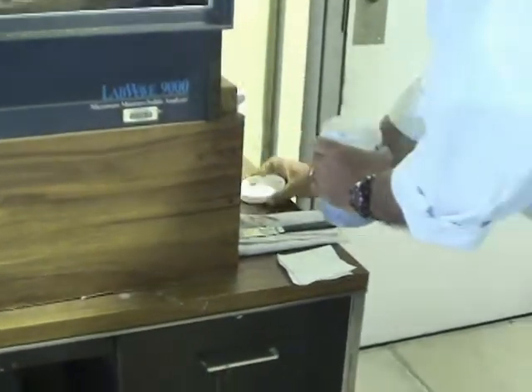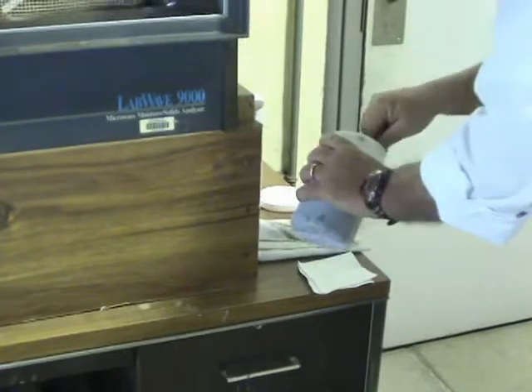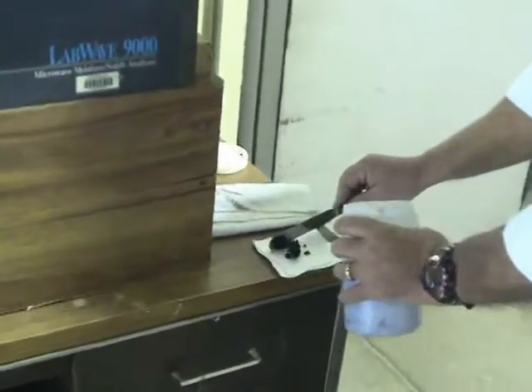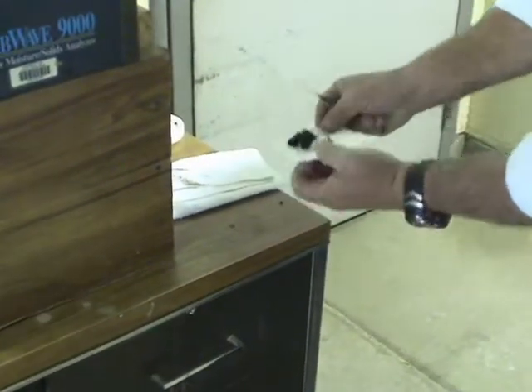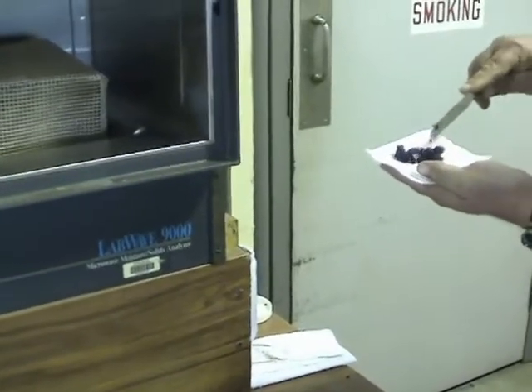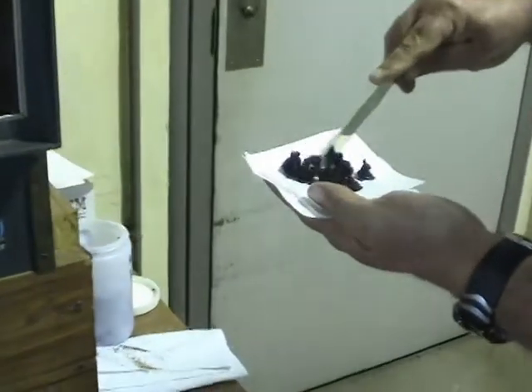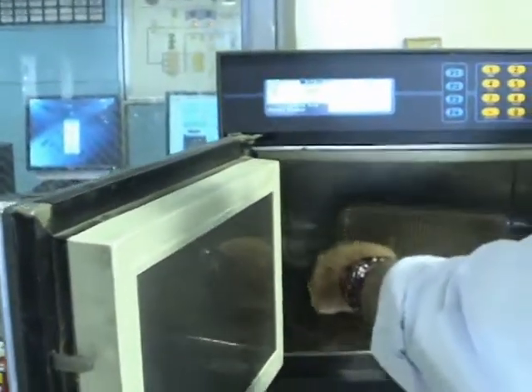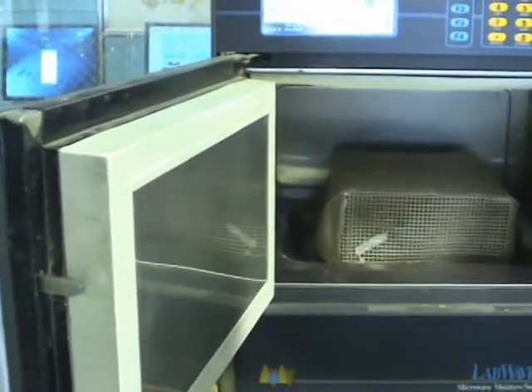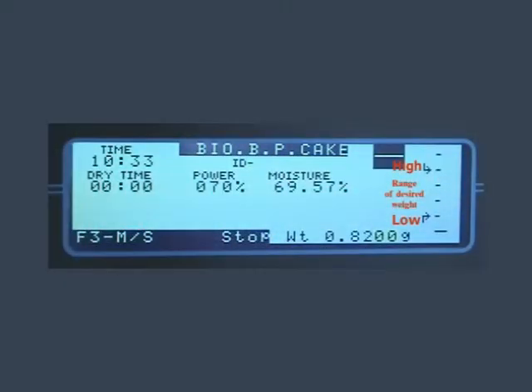The operator estimates the amount of sample needed for the analysis and adds the sample on top of the two sample pads. The sample, along with the two pads, is then put back into the microwave to ascertain whether the operator has added sufficient sample or whether he needs to reduce the amount of sample. This is illustrated on the display.